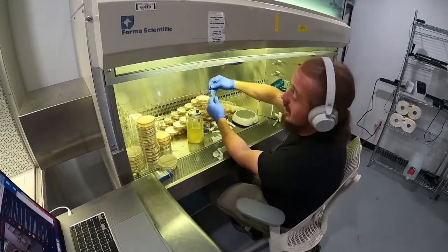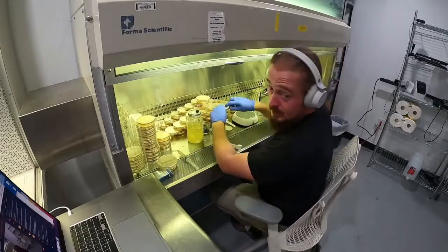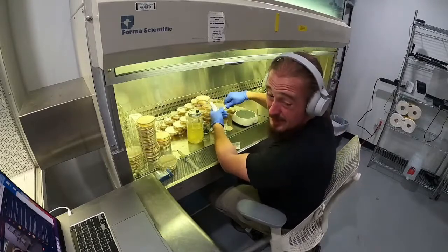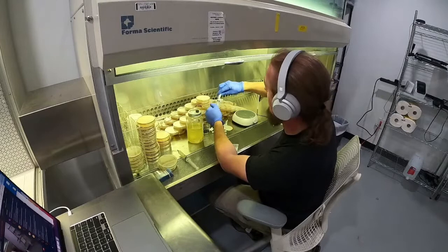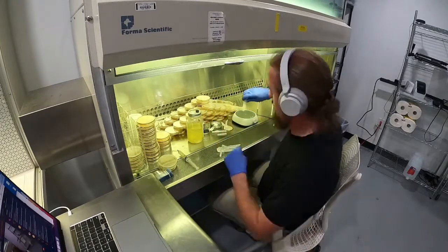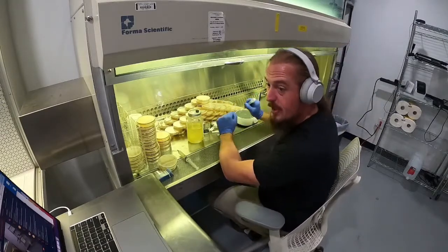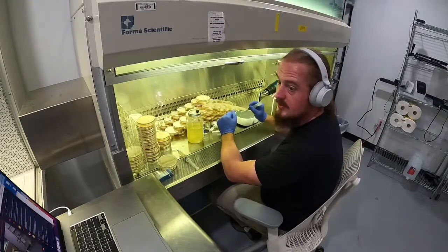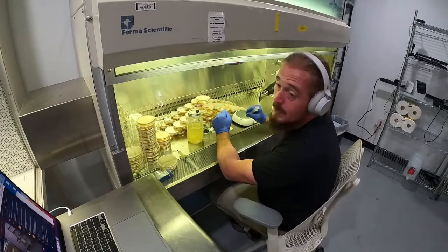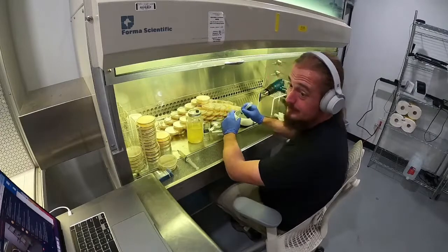But this flow hood that I'm working on cost me $1,500 American. I bought it used. It's probably 10 plus years old. It's been used by students and everything else. And guess what? I fired it up and I had it running and sterile within an hour. That's what real, no-nonsense lab equipment can do for you. This stuff will last for decades. My one flow hood, Rocinante, is from 1977. It's older than I am.